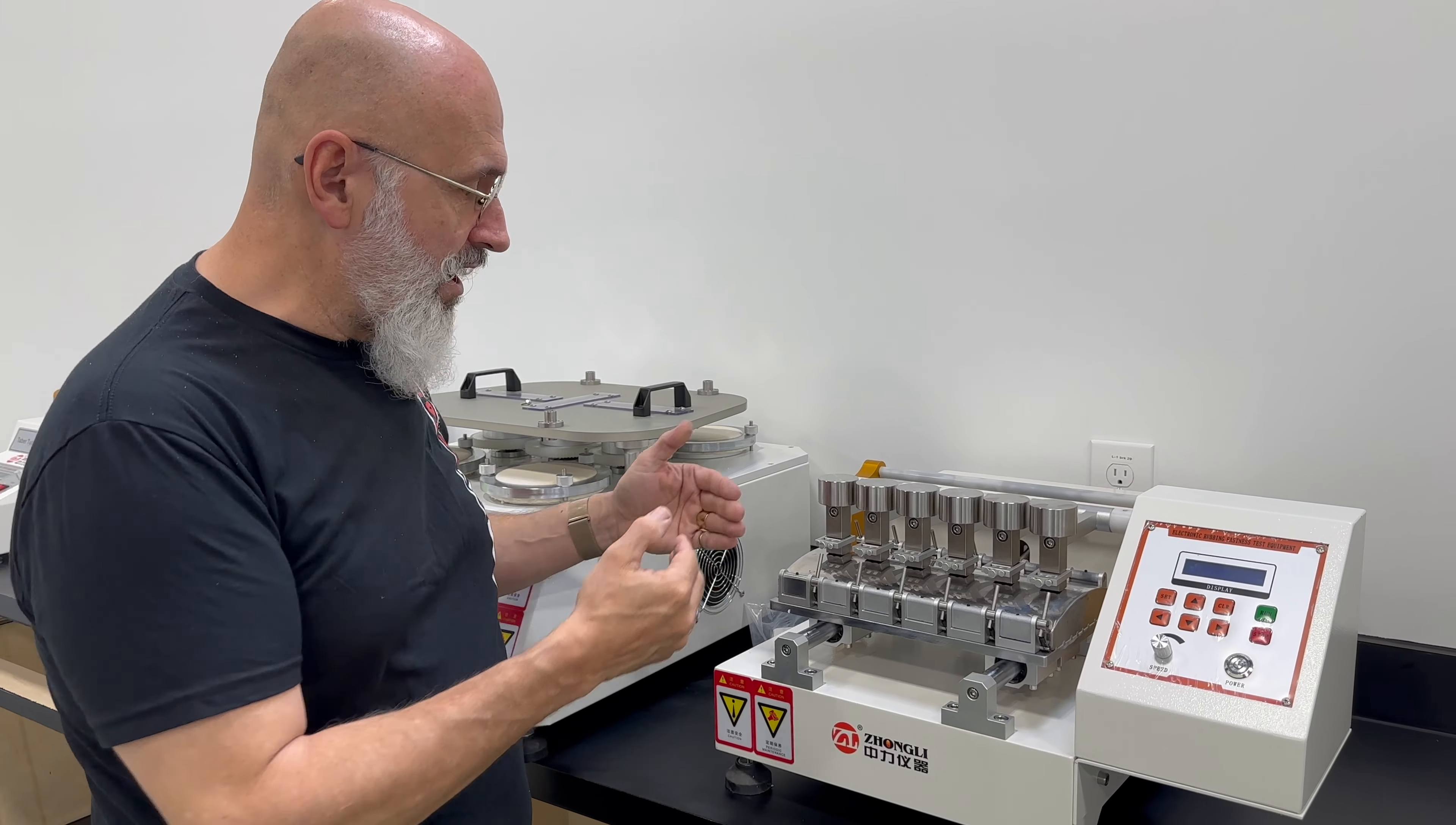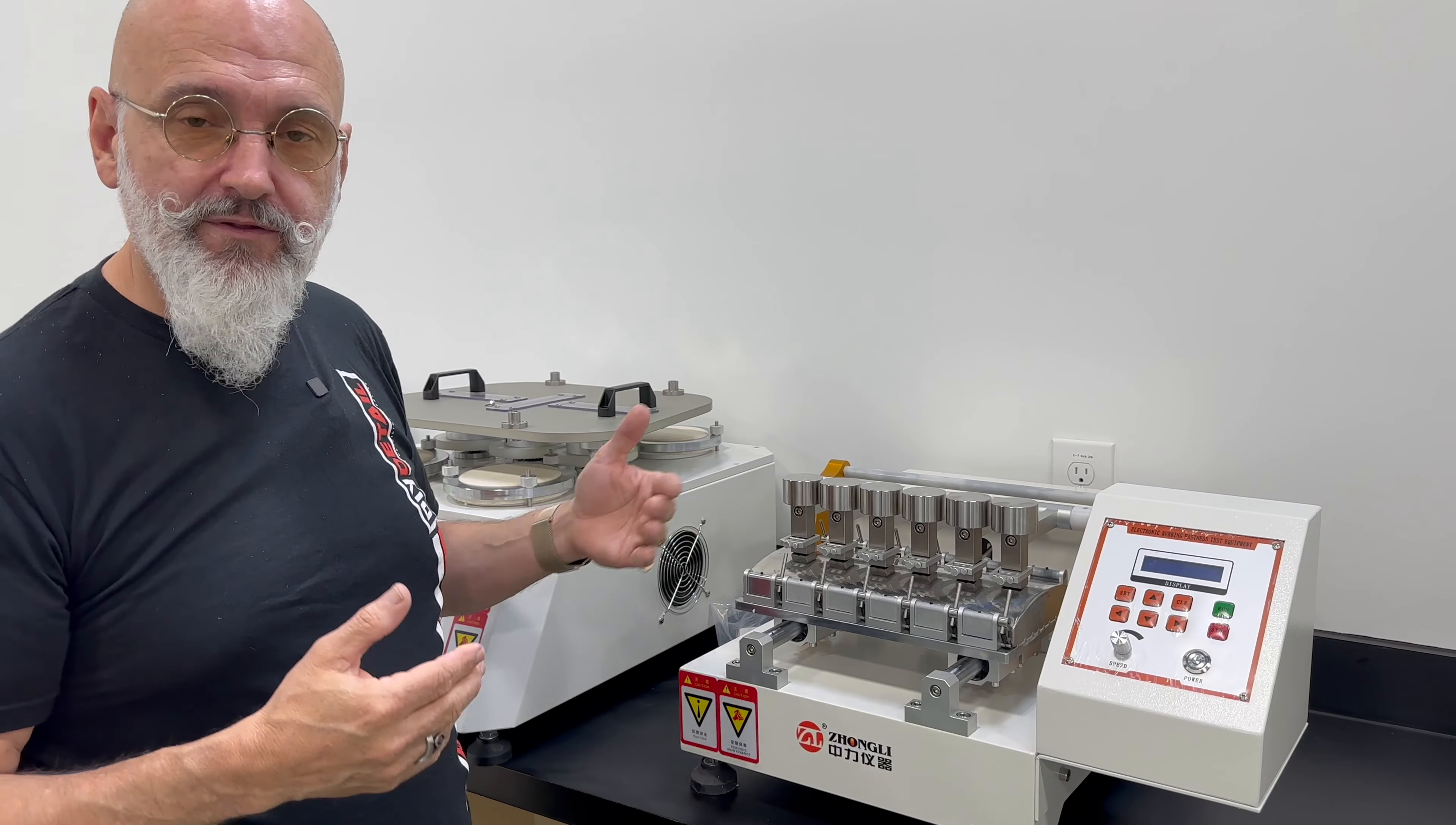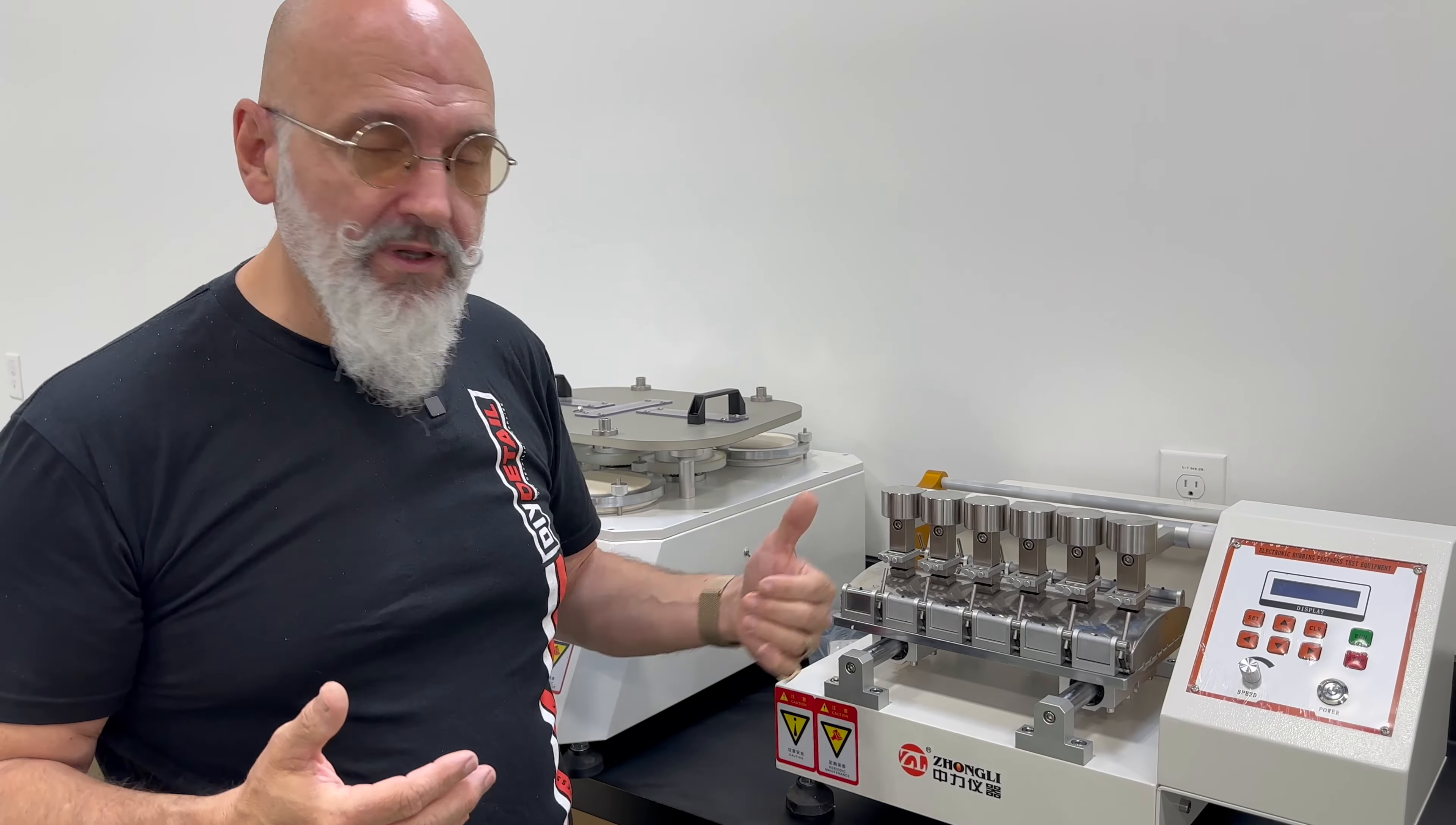And then this machine just rocks back and forth and moves back and forth. And the number of cycles before abrasion happens or color transfer happens, this will allow us to see that.